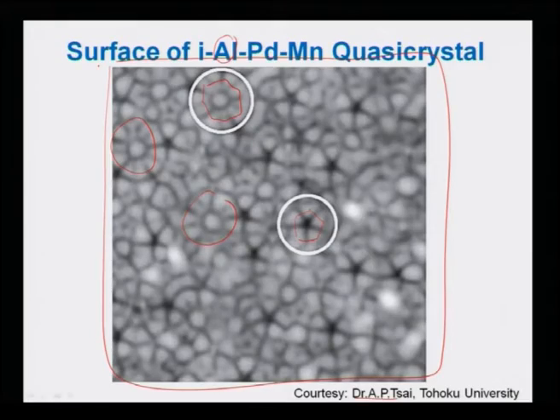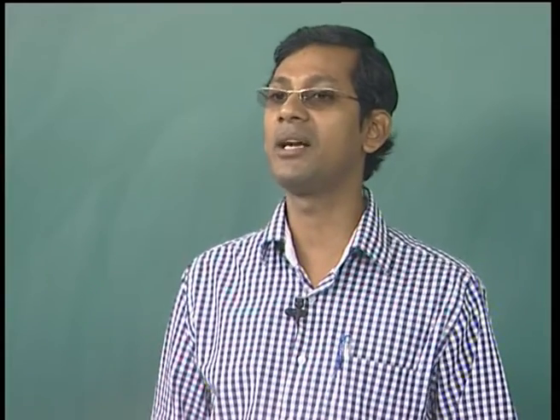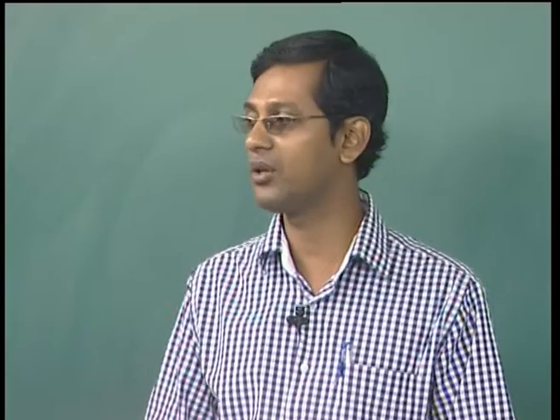And as I told you, mostly the conducting samples can be studied, so metallic samples look to be ideal for these conducting samples. That is why they are done.